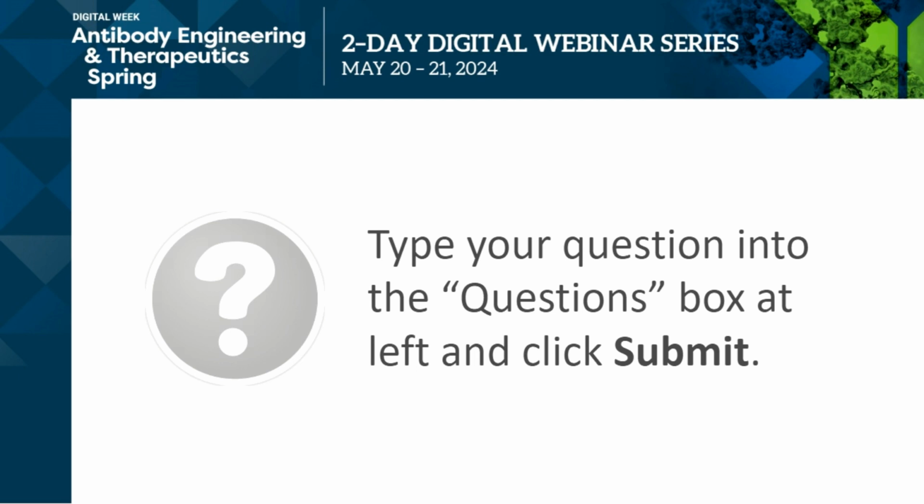And sometimes even if you are not happy that you want to make sure there is no non-specific binding interaction, we do have just the media as a reference or several other references where we do the background subtraction. And even if you want to block the surface, you can come in and block, but it doesn't block the specific interaction. It only blocks any non-specific interaction. So the blocking step is not needed for a Gator assay. And even if you want to do it, it just doesn't have an impact on it.